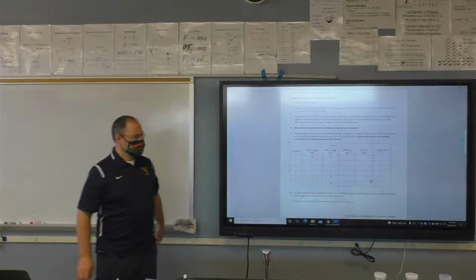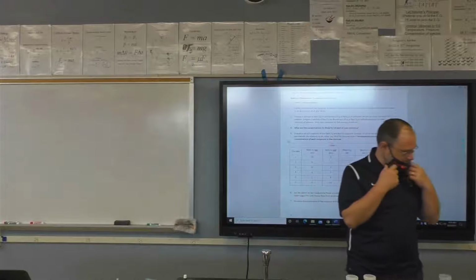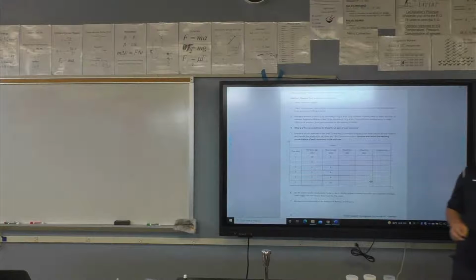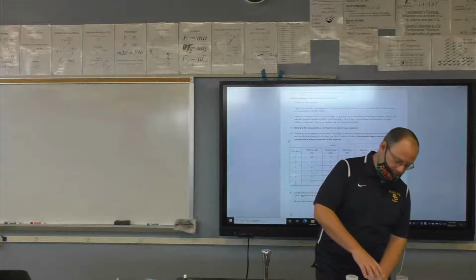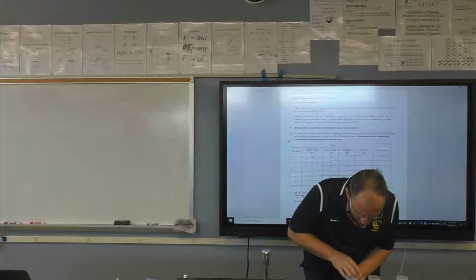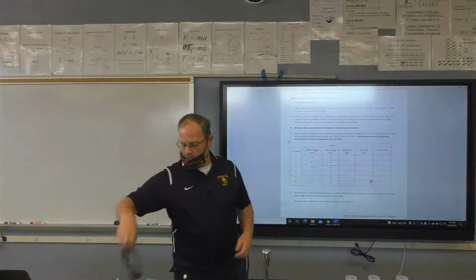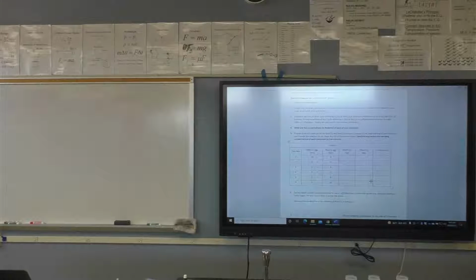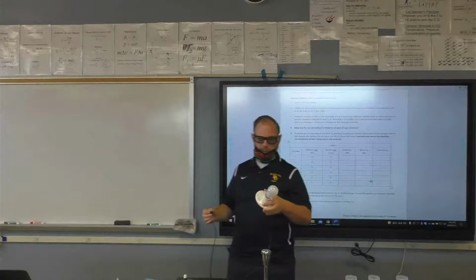All right. So we're going to do the conductivity of solutions, and again, conductivity is how well something conducts electricity. To briefly demonstrate this, I've got some water right here, as filtered as we can make it, and then I've got our sodium hydrogen carbonate right here, and our sodium carbonate right there, and we're going to hit it with some electricity. Specifically 110 volts AC. I have one of the oldest bulbs in the world right here. Old 60-watt incandescents.